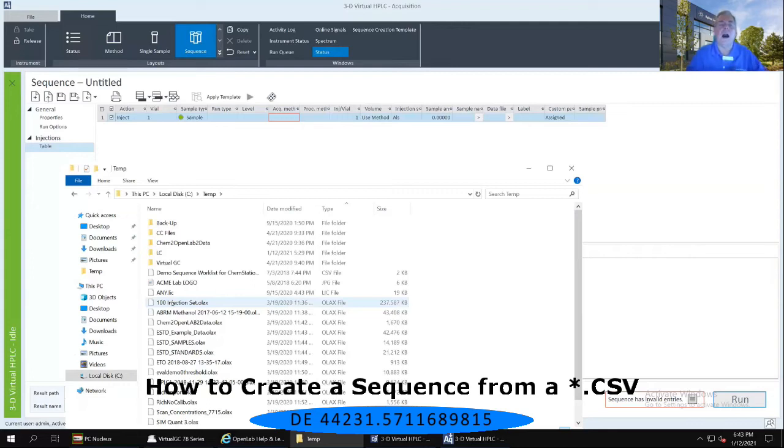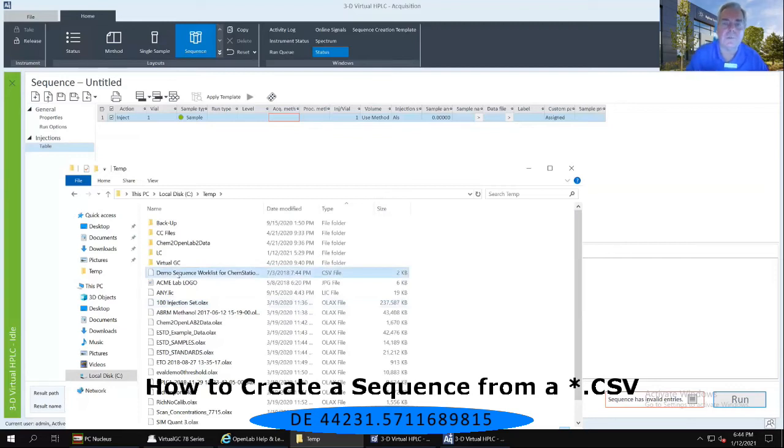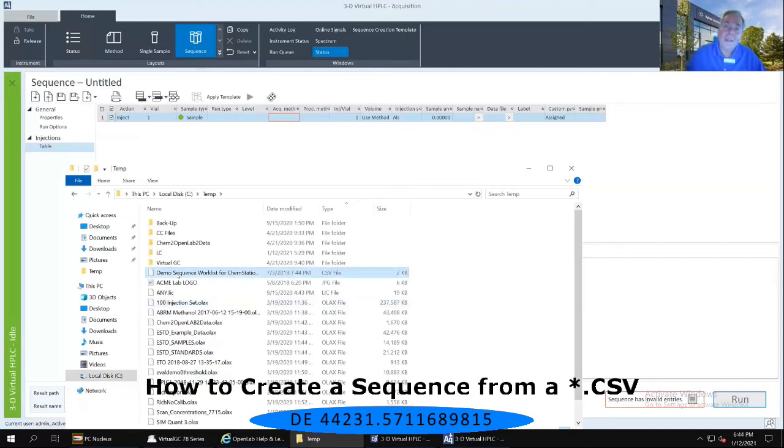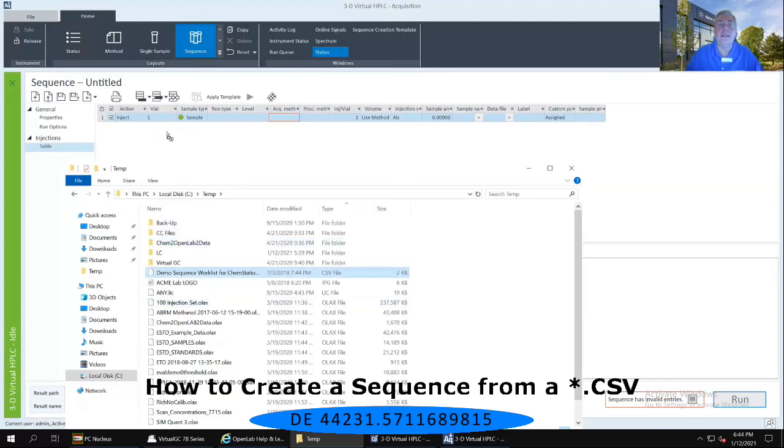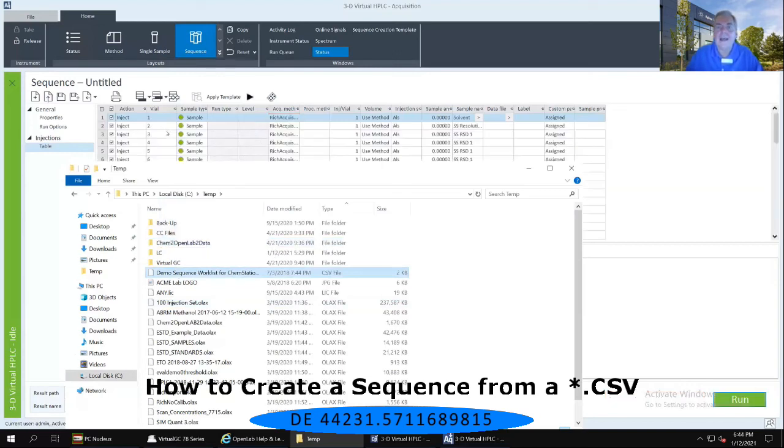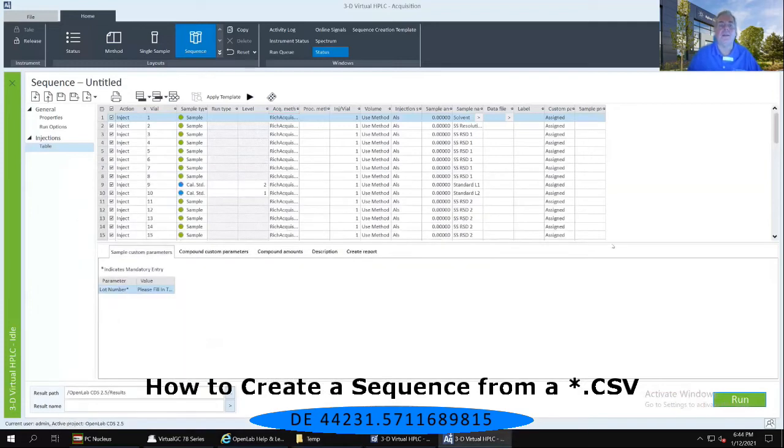I want you to single-mouse click on that demo sequence work list for ChemStation Import 2. And then, with it clicked, drag it to the sequence untitled window immediately behind it and release it. And it will immediately populate with the entire list from that CSV.